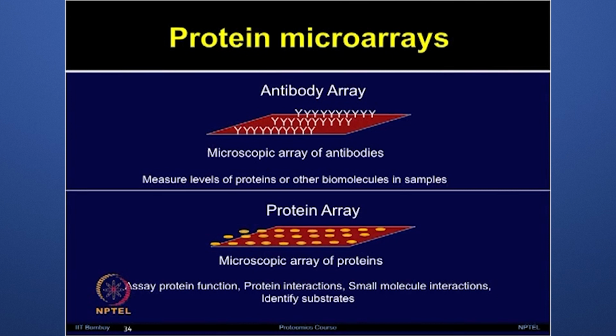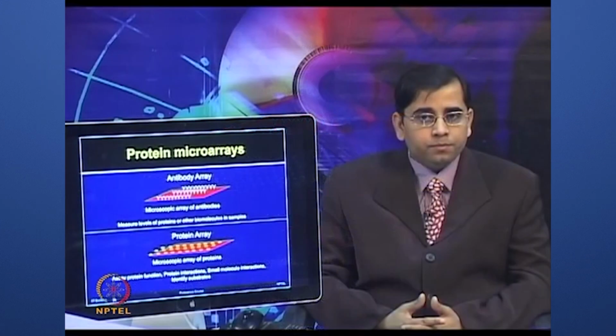Protein microarrays fall into two general broad classes: antibody arrays as well as test protein arrays. As shown in the slide, the antibody array is an abundance based method which is intended to inform the investigators how much of each protein is present in a sample, or to identify the proteins whose abundance is differentially expressed in one sample as compared to another sample.